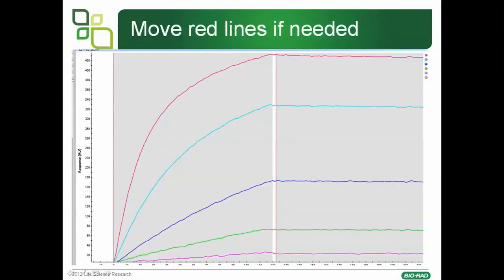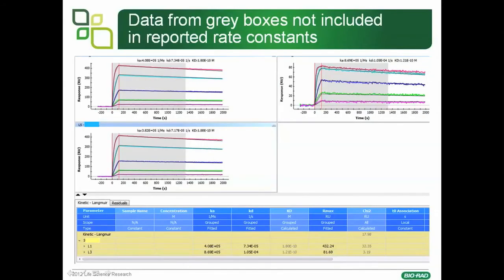There might be occasions where you need to move the red line. The left-hand red line marks the start of the association and the right-hand red line marks the start of the dissociation, and sometimes you may need to move those lines. The grey boxes denote regions where, whilst the software will fit at every single point along the sensorgrams, only the data in the grey boxes gets reported in the rate constants table at the bottom. For example, if you chose to exclude an area by not including it in the grey boxes, it would not appear in the tables, even though the data is fitted in the sensorgrams.